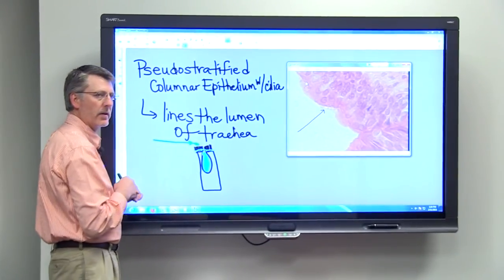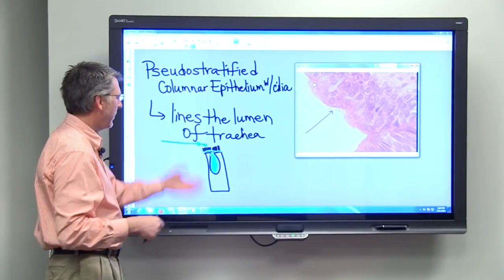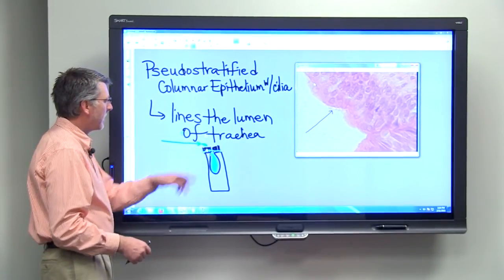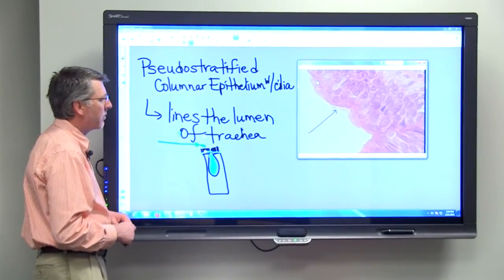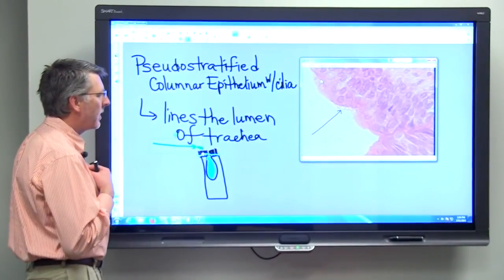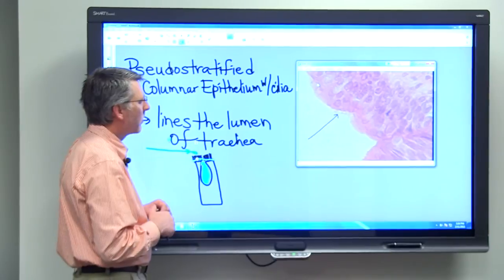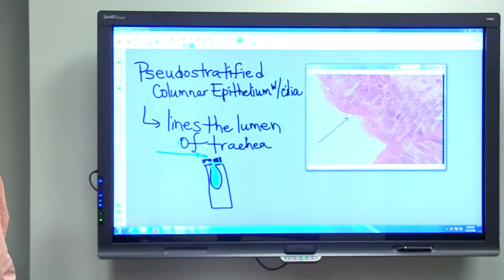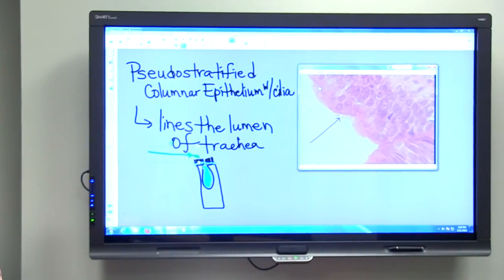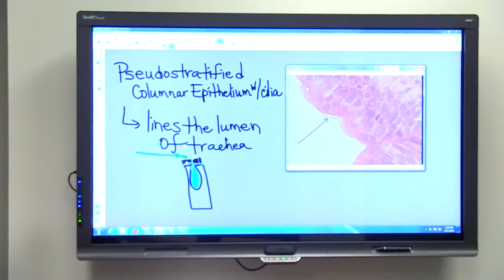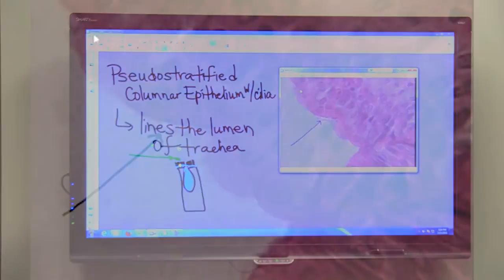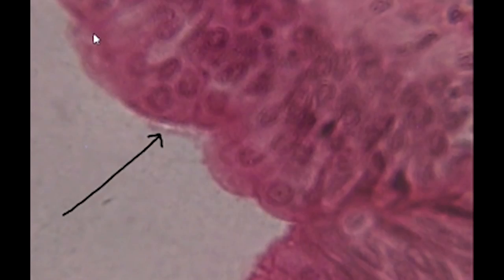The cilia can move that up towards your larynx. When it gets to your larynx, you can cough and then swallow or spit. Either way, you get that piece of debris out of your trachea and somewhere that's more appropriate. Look in this area for the cilia, and I'm going to adjust the magnification just a little bit which will help you pick up those cilia. Really fine and hard to see on this particular slide.